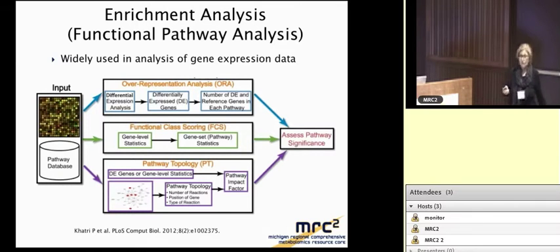Things that you need to keep in mind: as Maureen mentioned earlier, we're using a number of reference databases that contain various information about compounds, about spectra, about compound structures, molecular weights, and things like that. There's a number of those databases. There's a number of compound databases that also have a lot of various information.